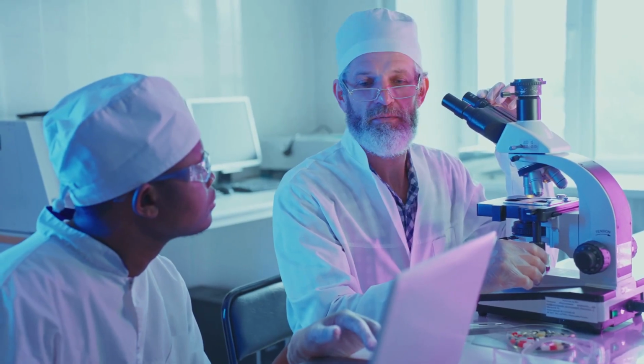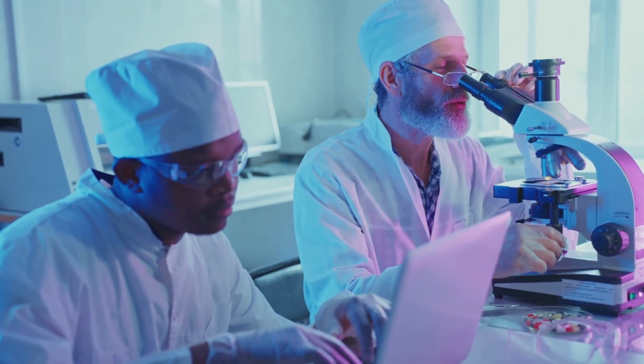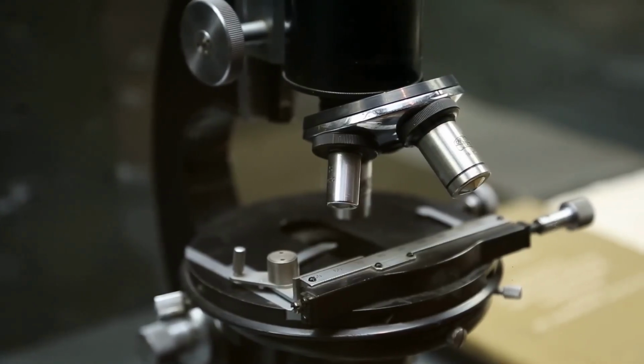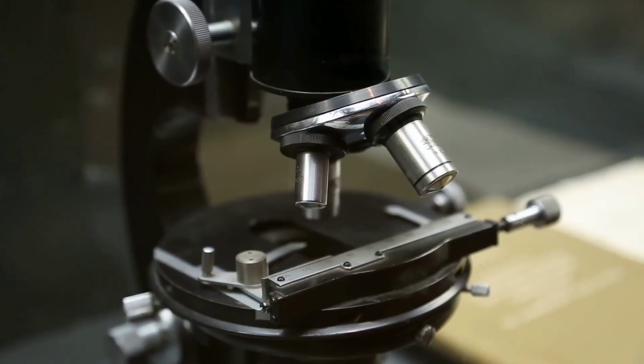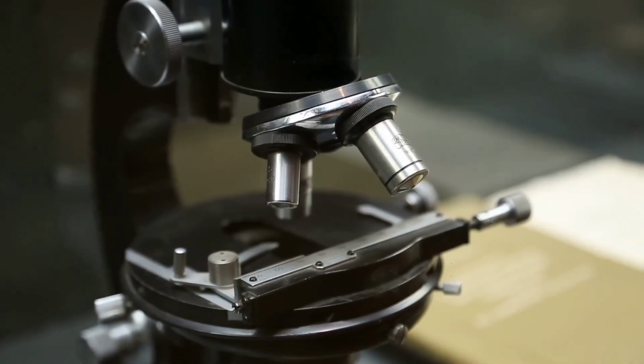Electrons are scattered by air molecules, so the whole path from source to detector is kept in a near-perfect vacuum. This is a big, complex, expensive setup. The final image isn't viewed through an eyepiece. It's formed on a fluorescent screen or captured by a digital camera and shown on a computer monitor.